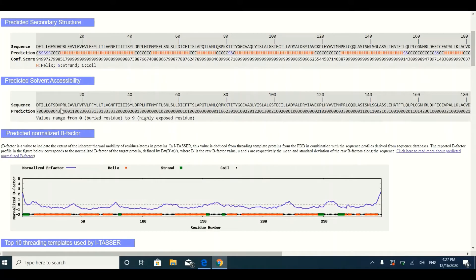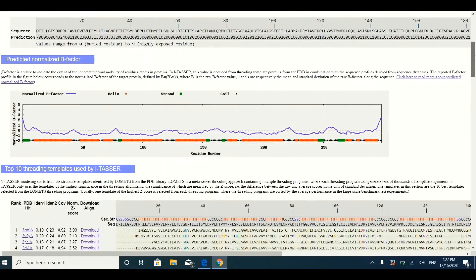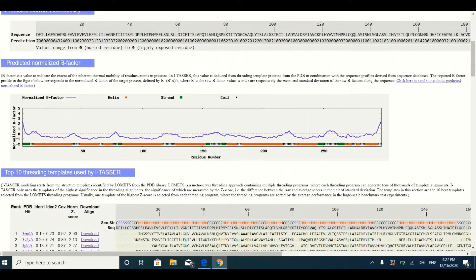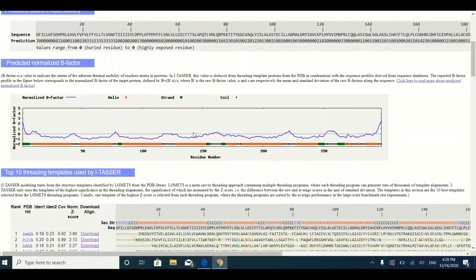So you can have a very good idea about the position and localization of your amino acids in your three-dimensional protein structure. Below that, you will find information about the B-factor, which indicates the flexibility of your protein. Flexibility refers to how much kinetic energy your amino acids are going to have. In this graph, scores below zero mean the amino acids are very rigid and less flexible.